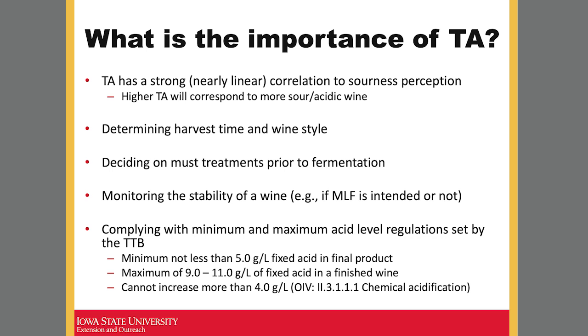That's also important to identify what type of treatment or adjustment you might need to do to reduce this acidity a little bit. If it's a high titratable acidity, you need to de-acidify your juice or your wine, and there are a lot of different techniques to do that. You can add potassium bicarbonate to the juice to reduce the acidity.